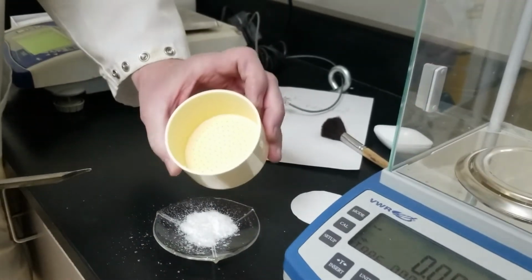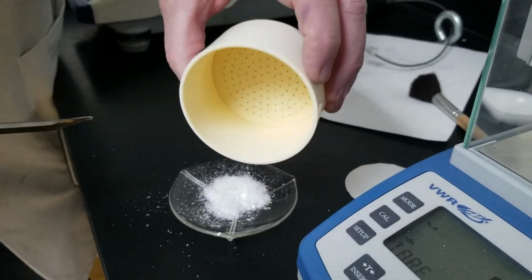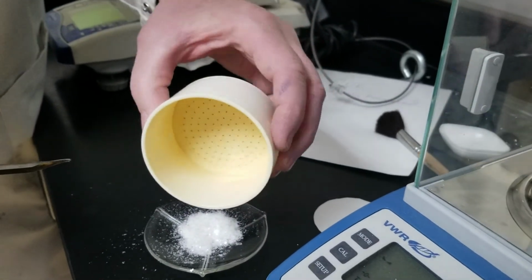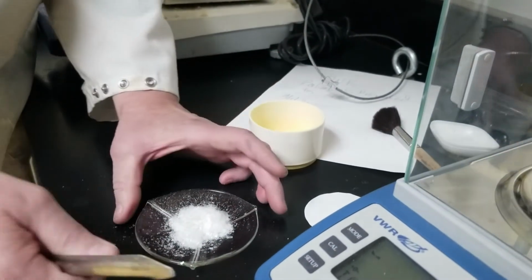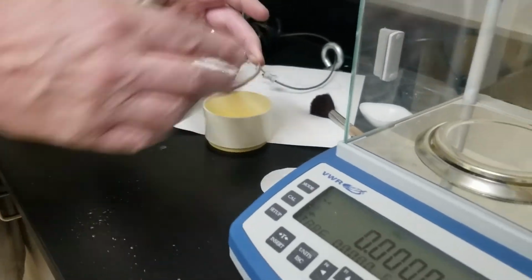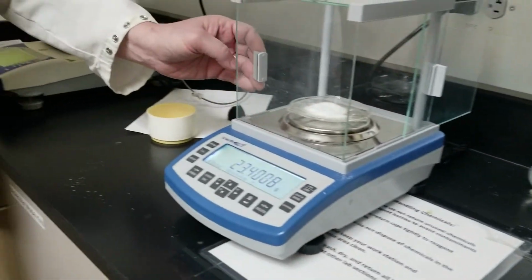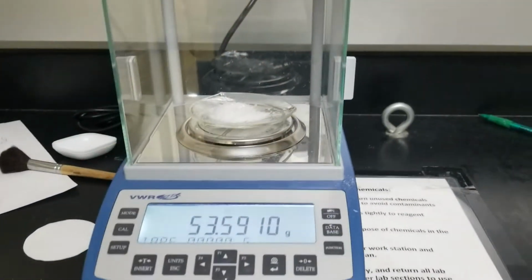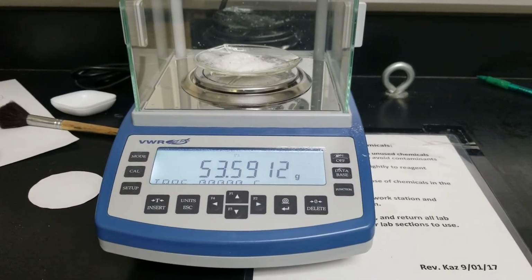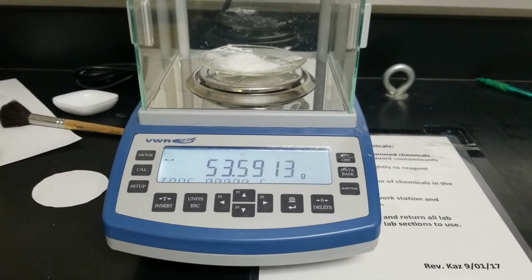Okay, guys, look inside. I can't get it all out. Can everybody see the sparkling? Barely. There's just a little bit of sparkling left. Most of it's on here, and again, we don't want to accidentally blow it away. It's very lightweight crystals. Okay, this is going to be our final yield. Make sure you get the weight by difference. Record that.